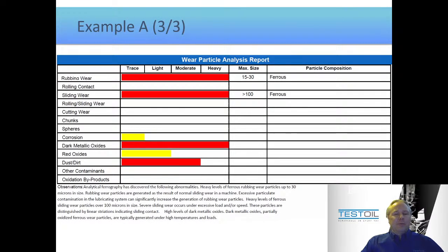And on the last page of the report, ferrography, there's usually one good reason you're going to see a ferrography result at all on a report, and that's because we automatically add ferrographies to any report with a high wear metal count or a high ferrous wear concentration. So generally when you get one of these on a report without having asked for one, it's because we've already identified that there's going to be problems there. We've identified that there's a high level of wear metals in your oil, so it's not unusual to see that your ferrography results tend to be high as well.